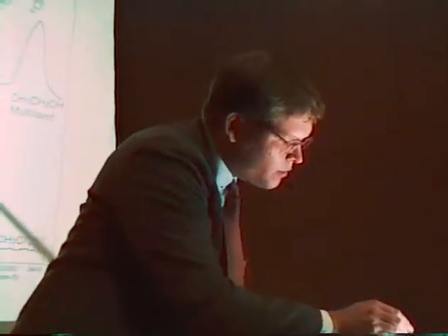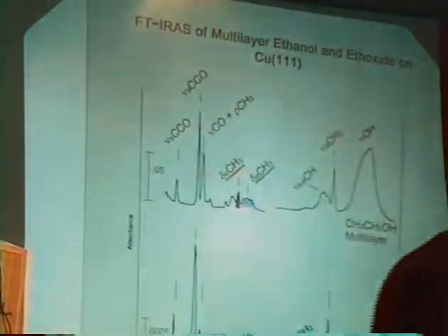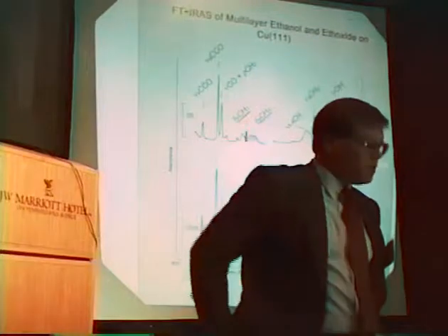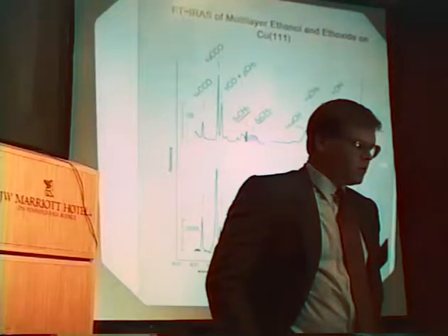Yeah, right, of course. And also, you find that some of the out-of-plane modes you can identify here in the weak modes in the skeletal group, you can identify the out-of-plane methyl group rock, and it's not present in the ethoxide. But this sounds like you've got better than 90% of the normal modes identified, and done well enough to have done isotope shifts and so on.